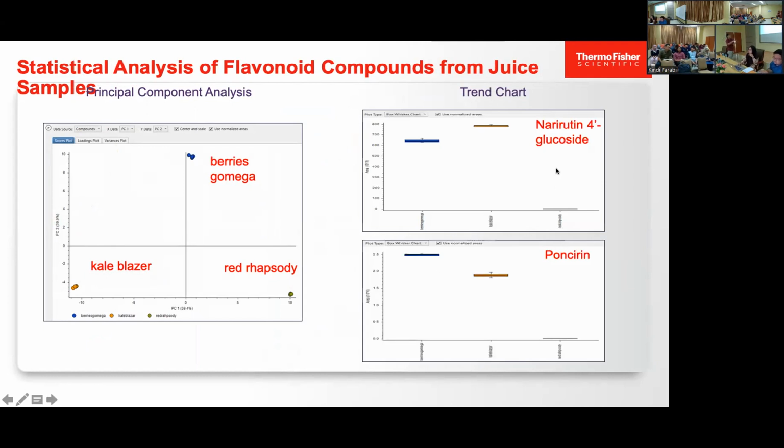Okay, so this one is a specific compound. When you deep dive into a specific compound, you see the concentration for this cluster versus this cluster. And you see the other one is very small. So these two compounds are only present in this and this cluster. It doesn't form so much in the red cluster. Next.